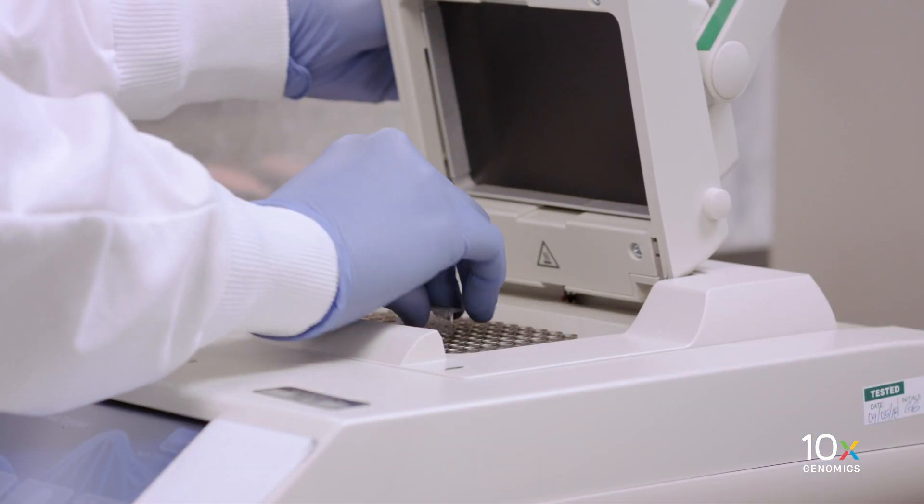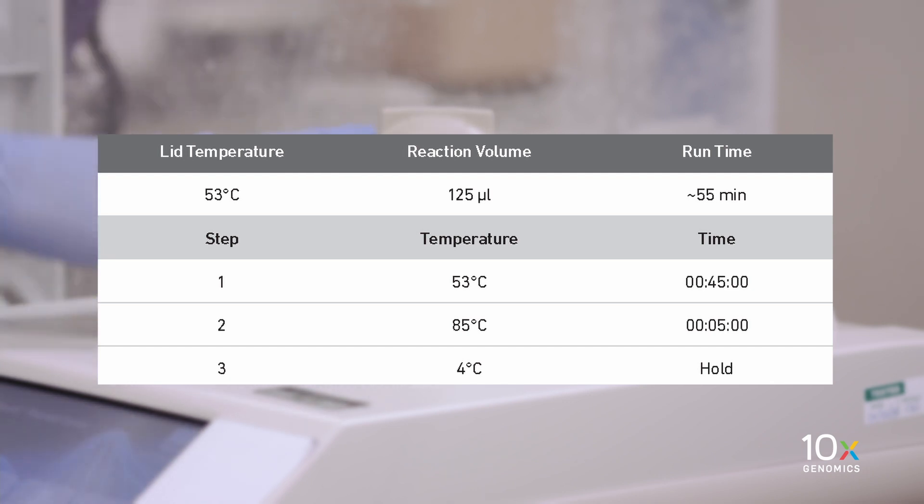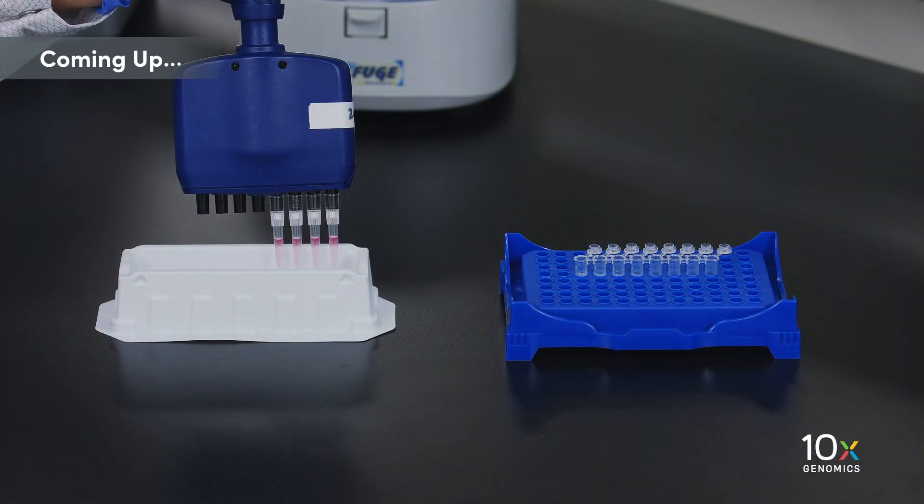Incubate in a thermal cycler with the following protocol from the user guide. We have completed gem transfer and gem RT incubation. Next, we are ready to break the gems.